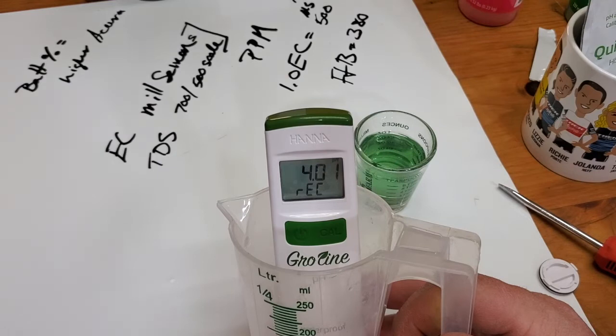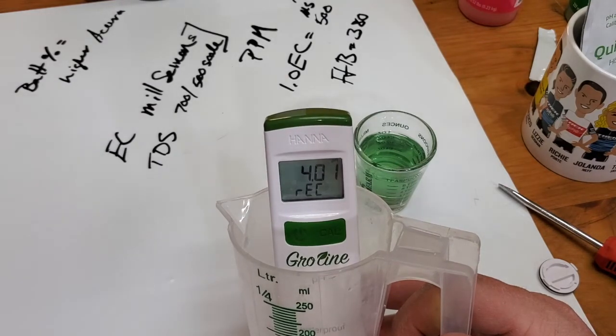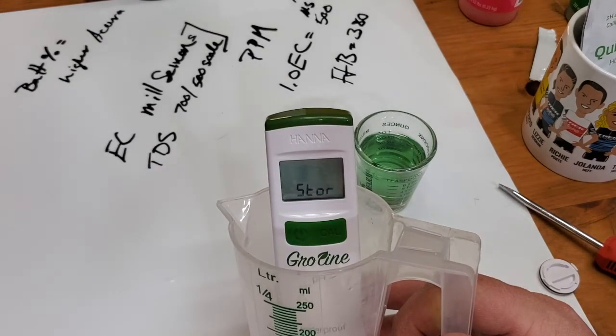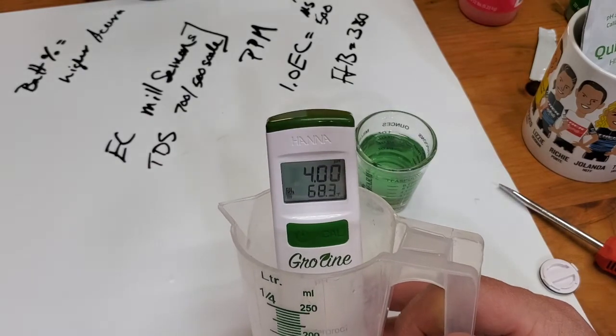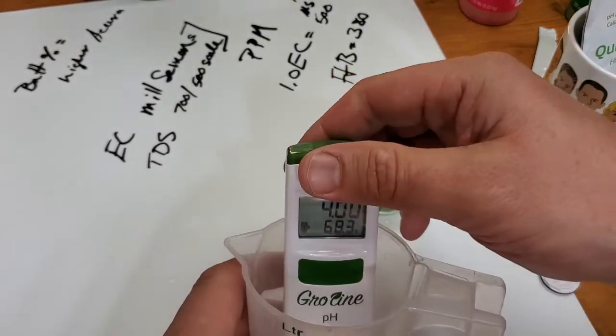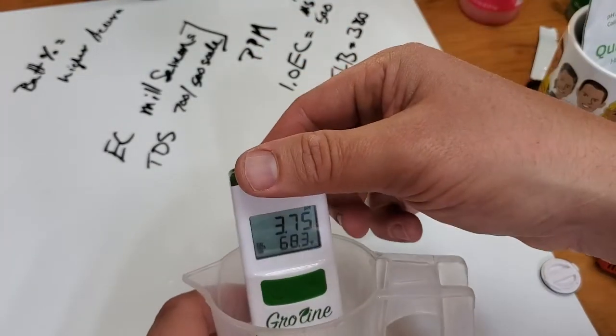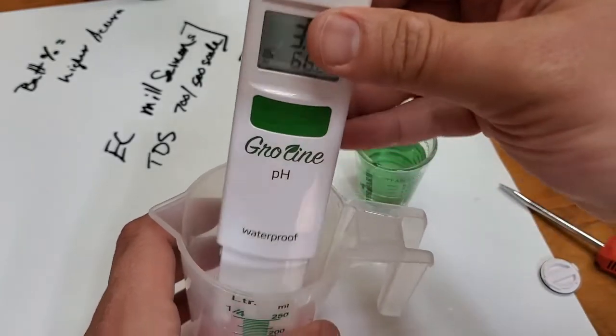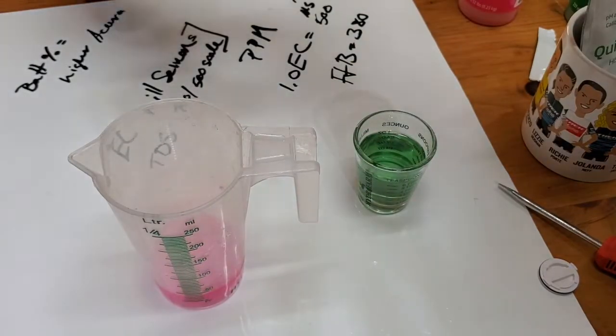Once it times out, it'll be done. It should go back to the main screen. Now it's calibrated. So if you don't have the Quick Cal solution on hand, that's how you do a standard calibration.